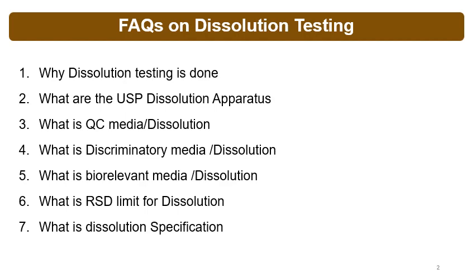If the tablet is too hard, then this method should detect the batch, and based on that discrimination, the batch is rejected.